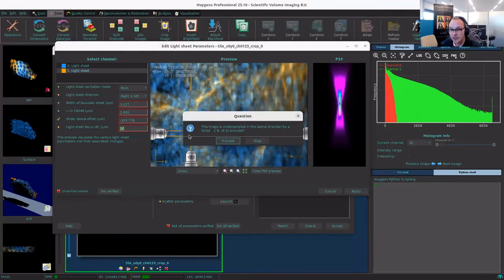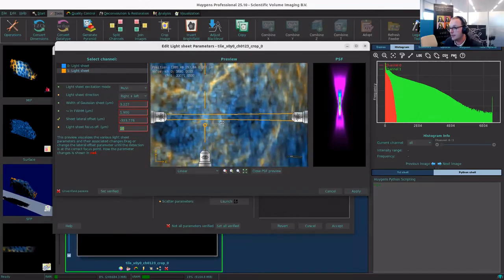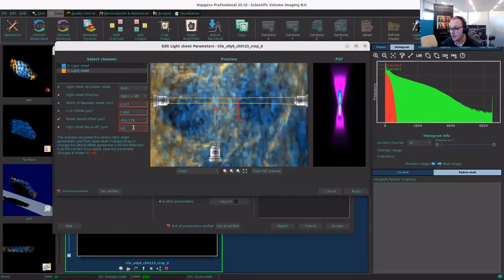If you notice, there's another question. If you notice the illumination is off center, can you adjust that at this time? Yes, you can do that. If I understand your question right, your question is that if you notice that the illumination is not aligned with your light sheet, like is the case here, then you change that by changing this number, and then the red circle indicates the focus of your detection. I hope that answers your question.